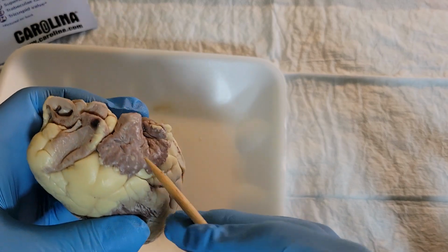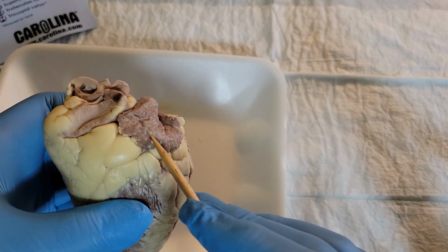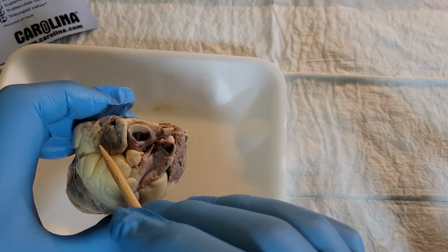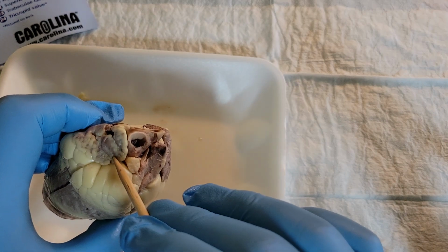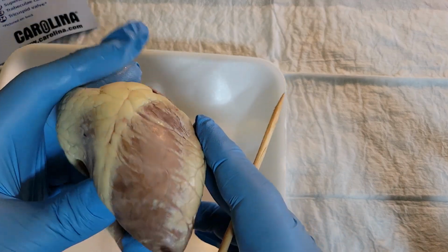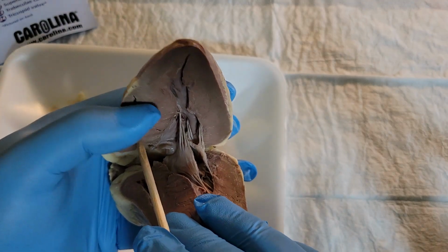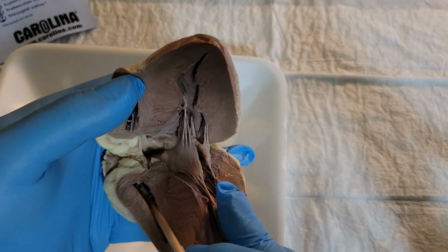The right and left auricle, so this would be my right auricle right here, and my left auricle. My tricuspid valve got a little cut up, but it would be in here, tricuspid valve.